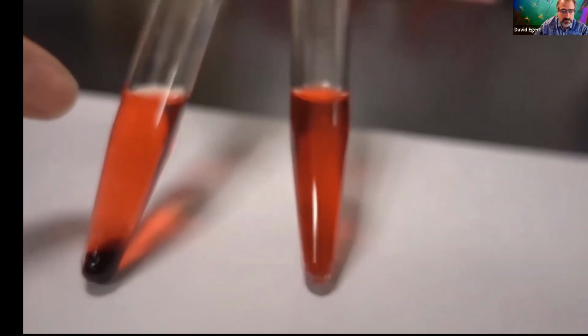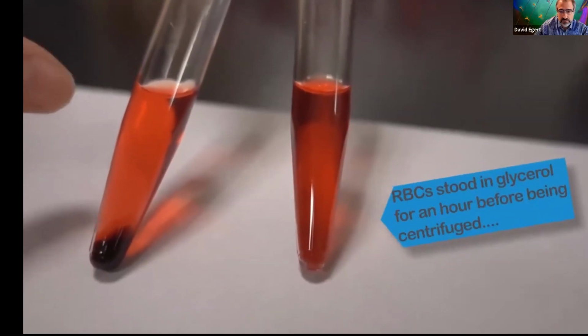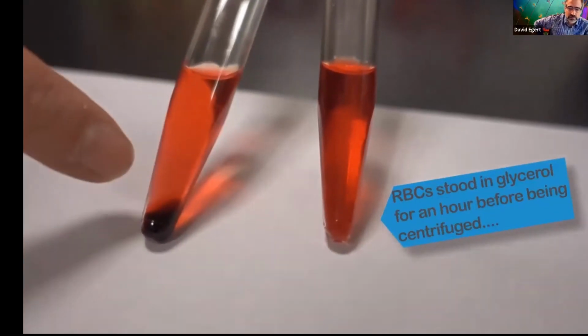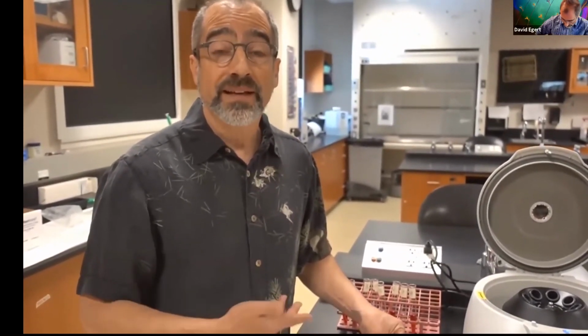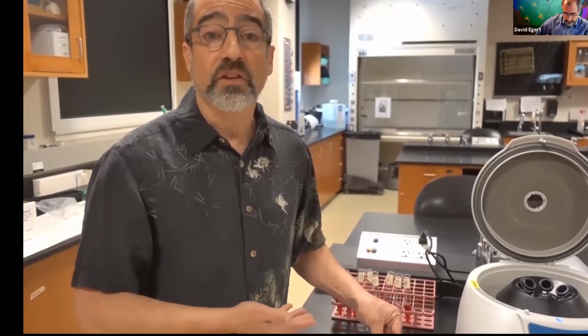Whereas in this one, where the cells sat in the glycerol for about an hour before we actually spun them down, there's no pellet, which is telling us that the longer you sit in the glycerol, the more likely you are to explode. And we're going to talk about that more in detail as well. So kind of why that happened and why that makes sense. And actually we'll even talk about how this part would be different with human blood cells versus bovine blood cells.